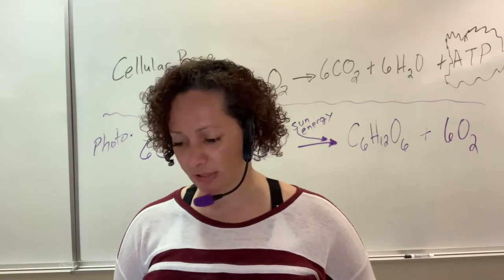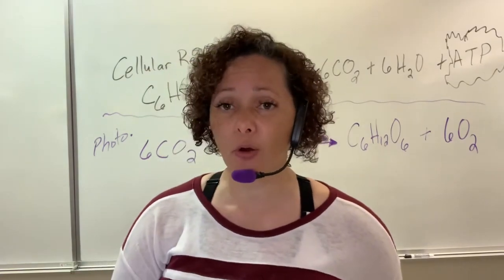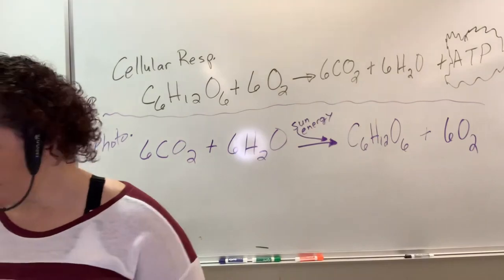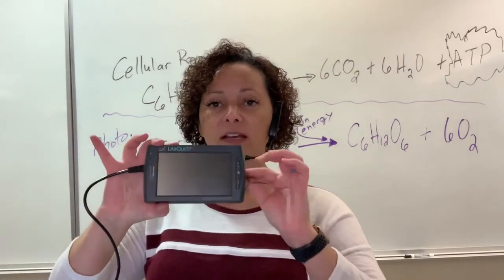All right, so with that, to get set up, so procedure. I'm looking at your procedure part of it. To get set up, you want to set up your LabQuest equipment. The nice thing is you have already used your LabQuest equipment. So this is your Vernier. You've used this before several times.